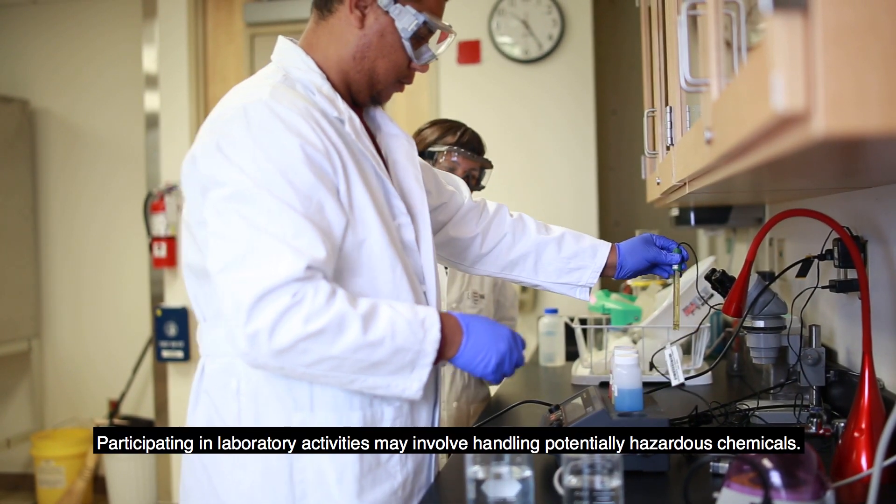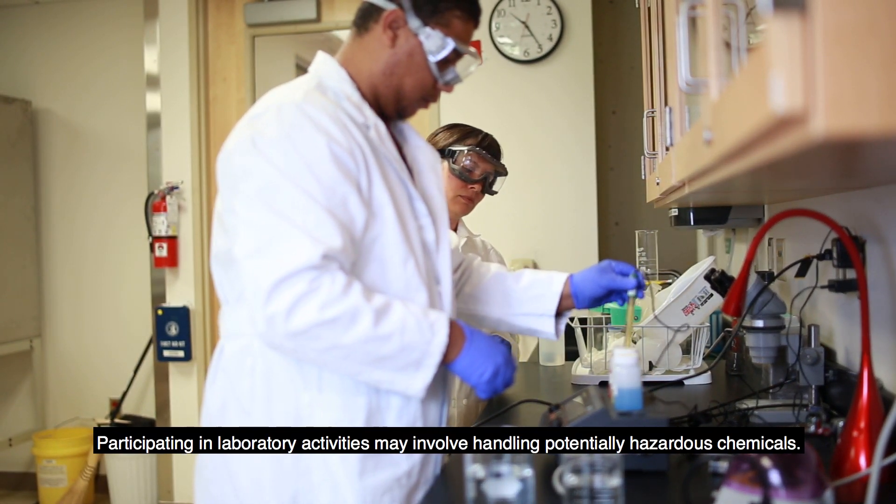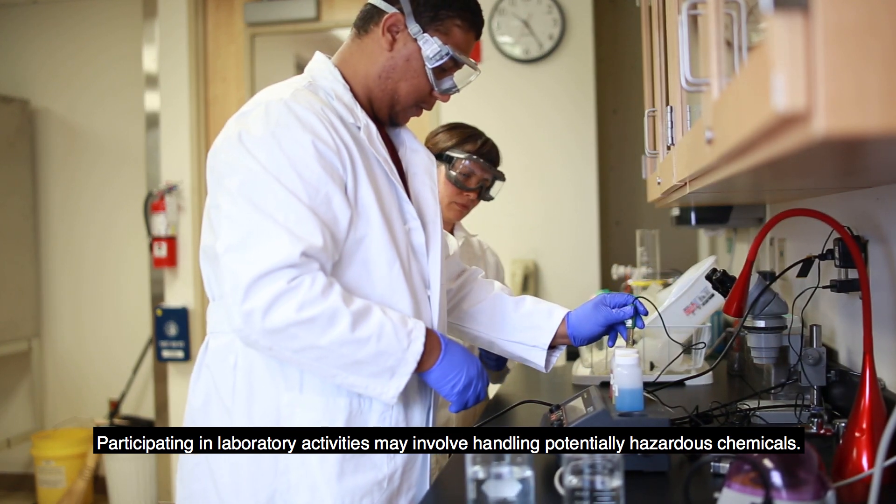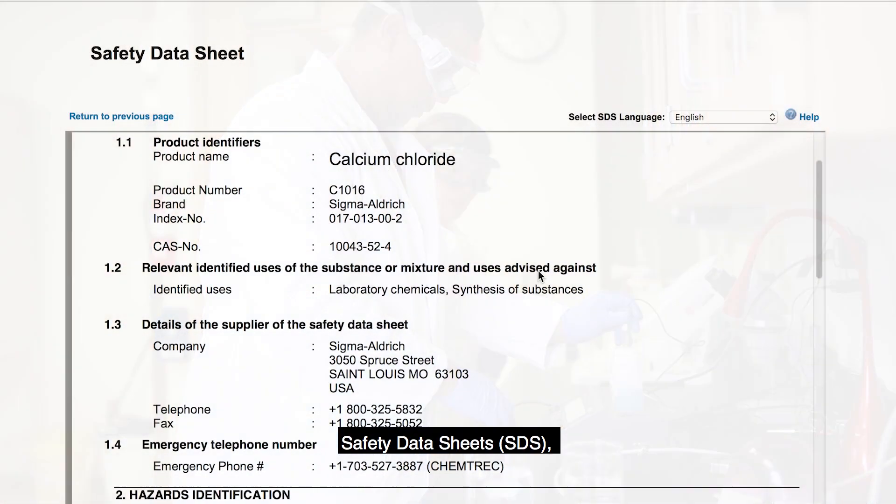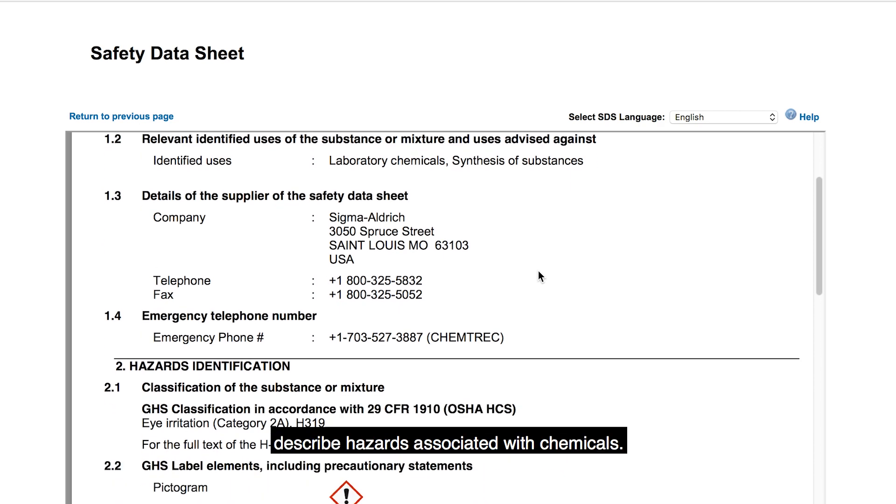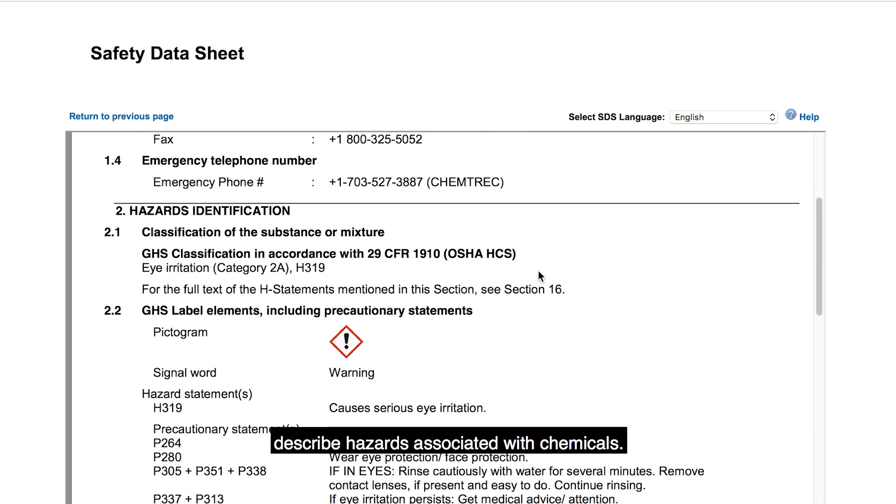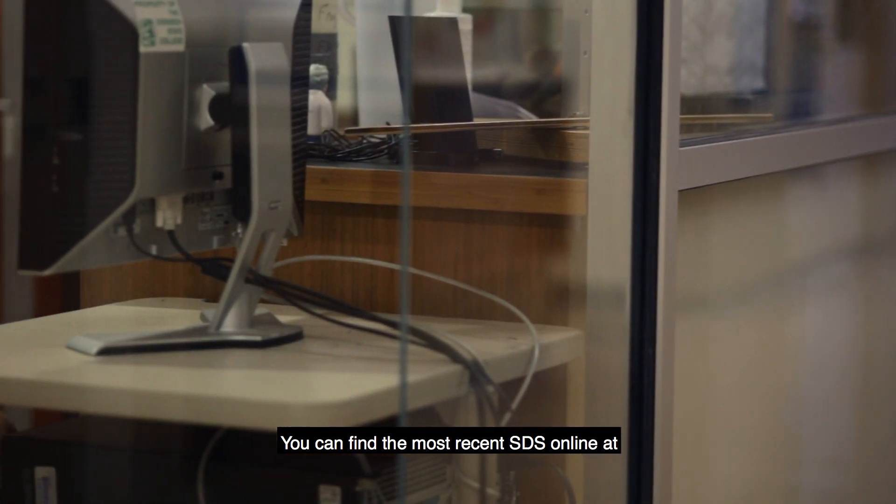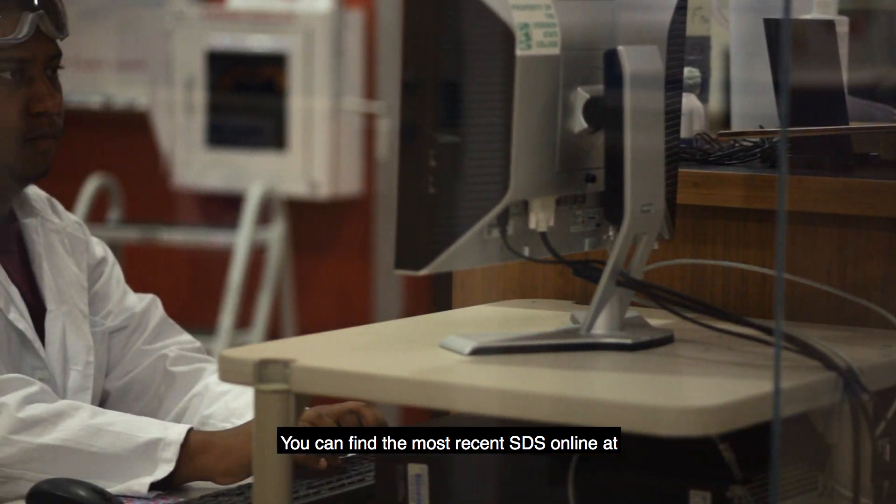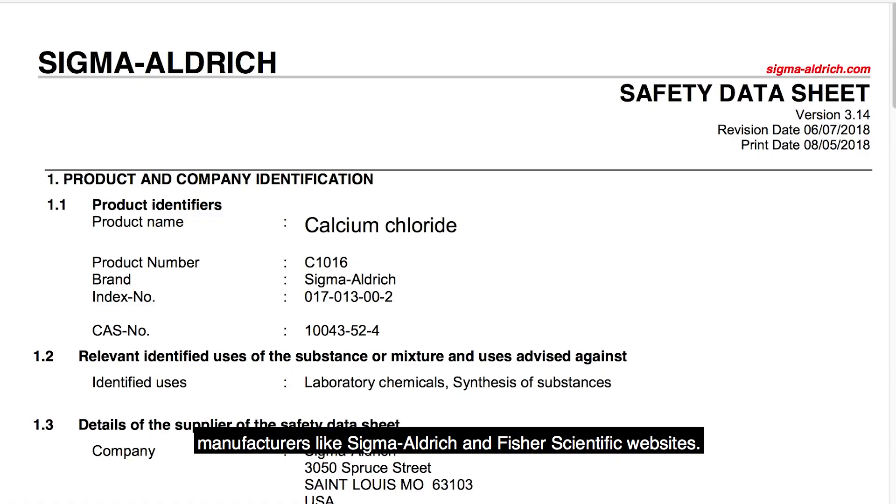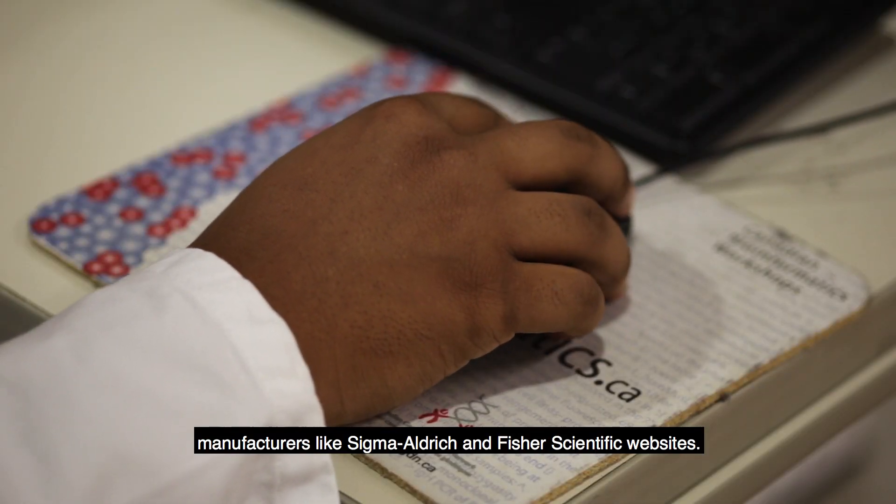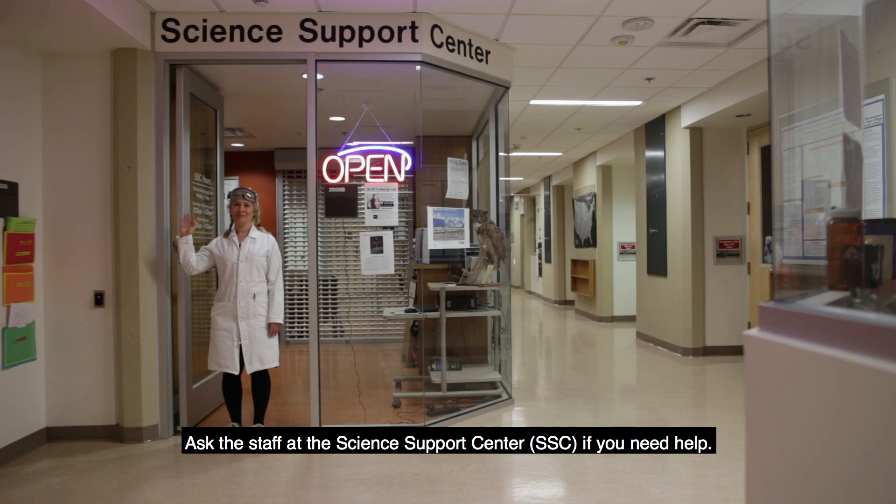Participating in laboratory activities may involve handling potentially hazardous chemicals. Safety data sheets describe hazards associated with chemicals. You can find the most recent SDS online at manufacturers like Sigma, Aldrich, and Fisher's scientific websites. Ask the staff at the Science Support Center if you need help.